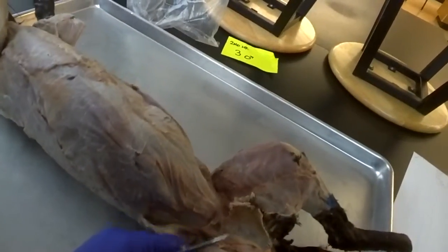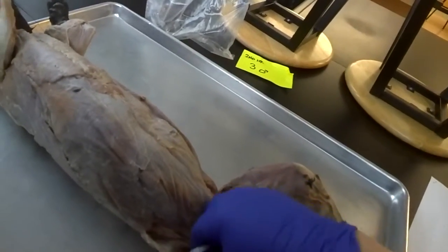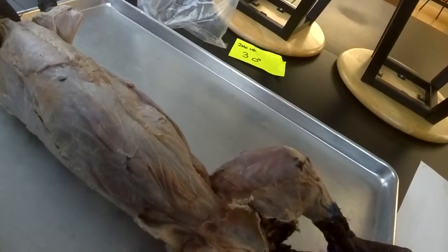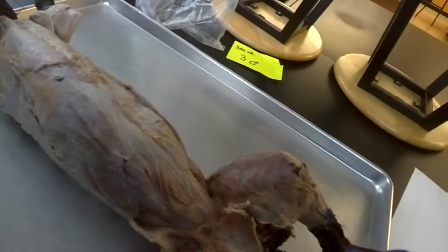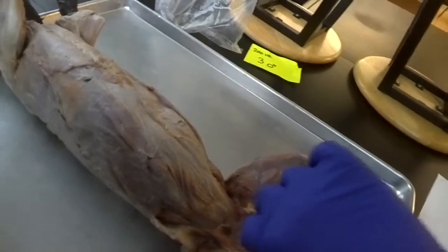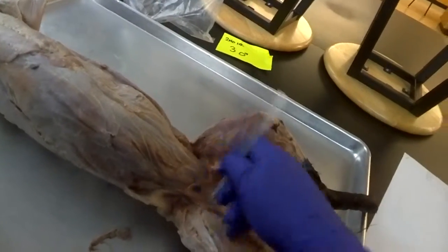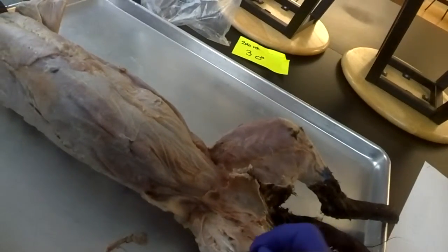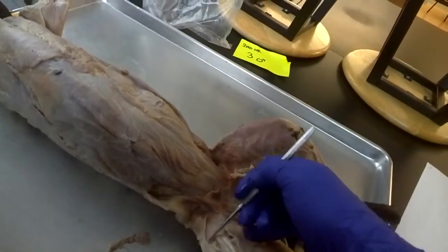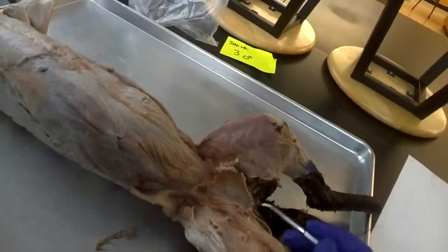We're going to take a look at some of the quad muscles. On this cat it's quite clear. Clearing a little bit of this fascia, you can see the bright white. If I insert the probe, I can separate out a few layers. That first layer on the outside is the vastus lateralis. The layer right on the inside is the vastus medialis. And then running right up and down the middle is the rectus femoris. These all lie underneath the tensor fascia and the tensor fasciolata. And that's the upper half.